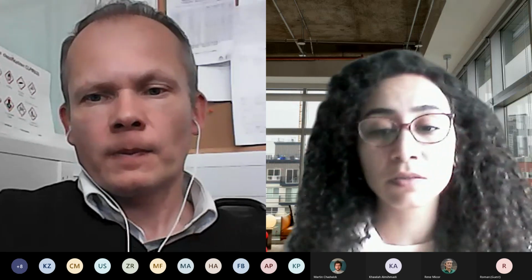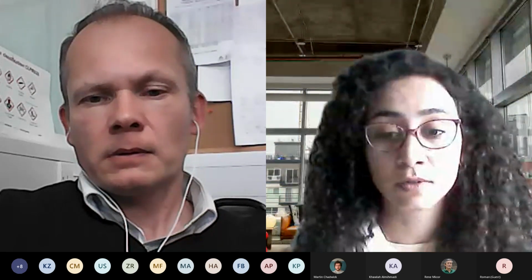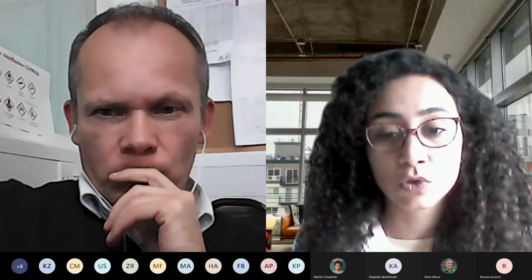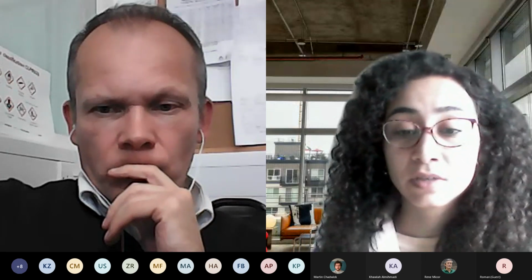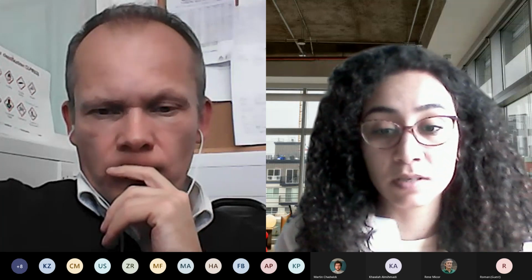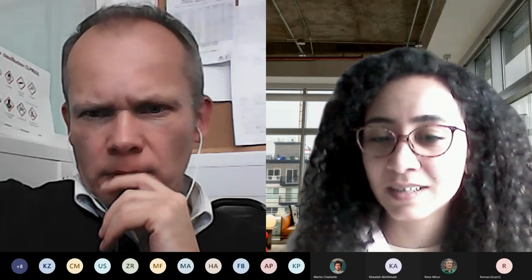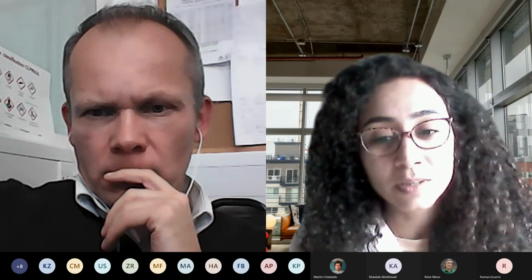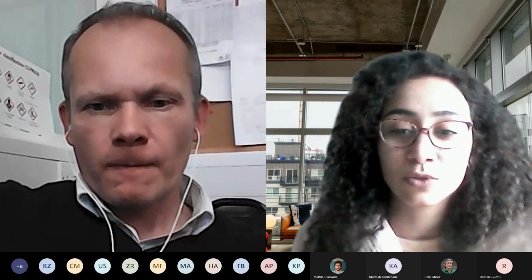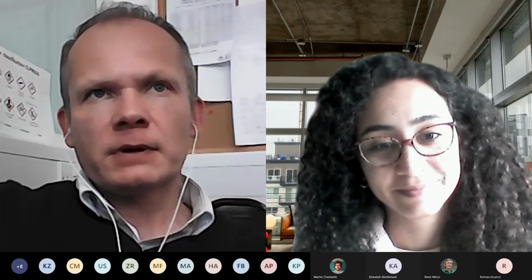Thank you so much. Actually, we have a paper to compare. We actually proved it works for bacteria, and we published it. And now we realize it works for platelet aggregation, but it's really hard to interpret the measurement of platelet aggregation because they are quite small, and we are confused about how to understand it. So yes, it will be really nice to contact you, and we also have some data. Maybe if you want, you can check. Okay. I will do my best if I can help.